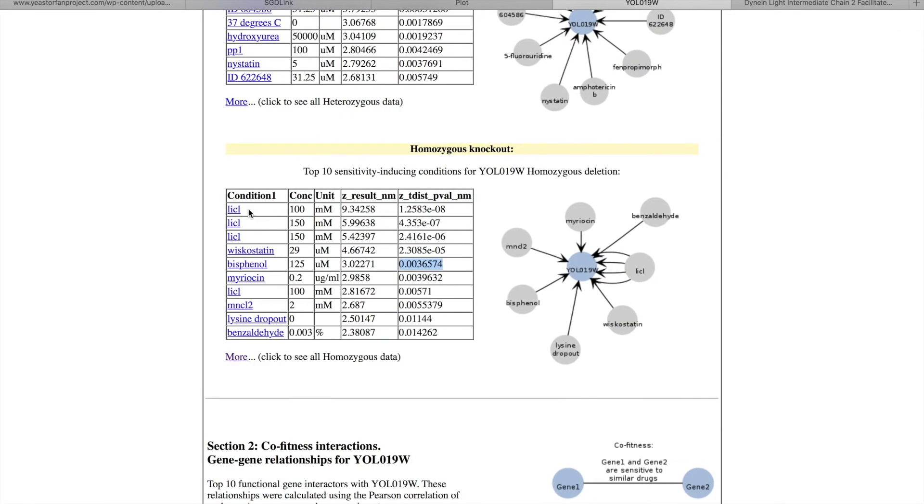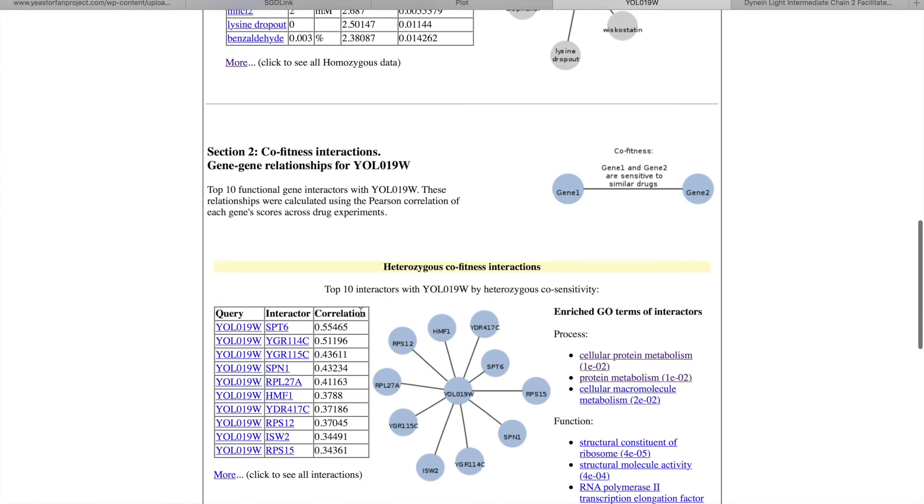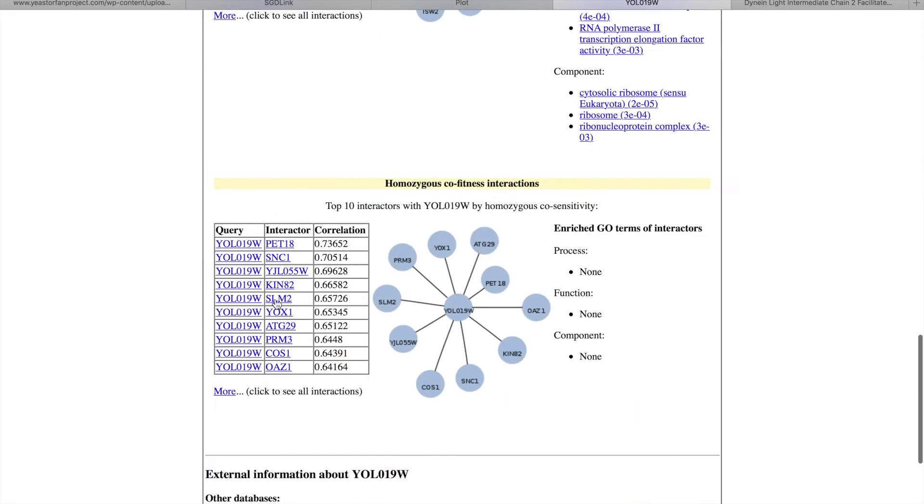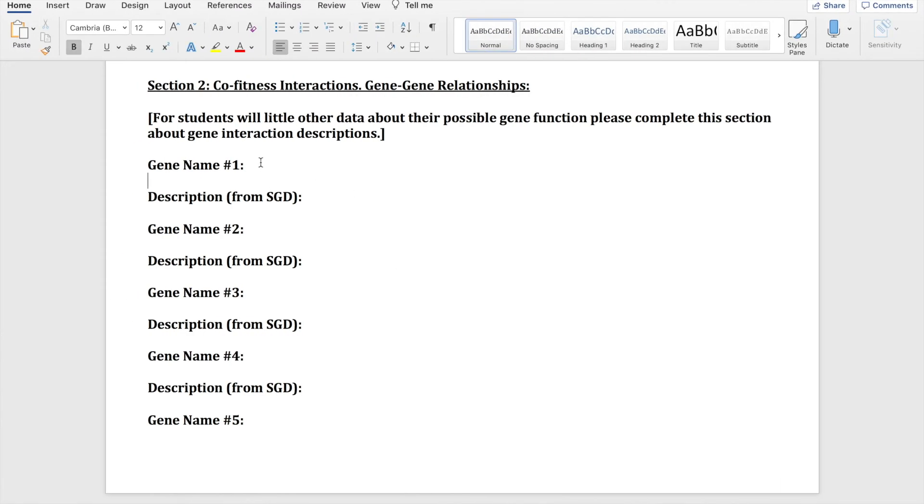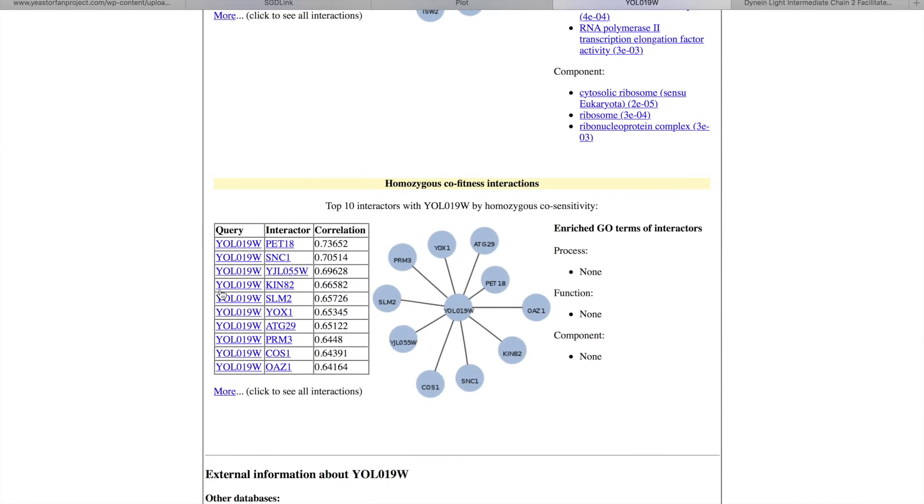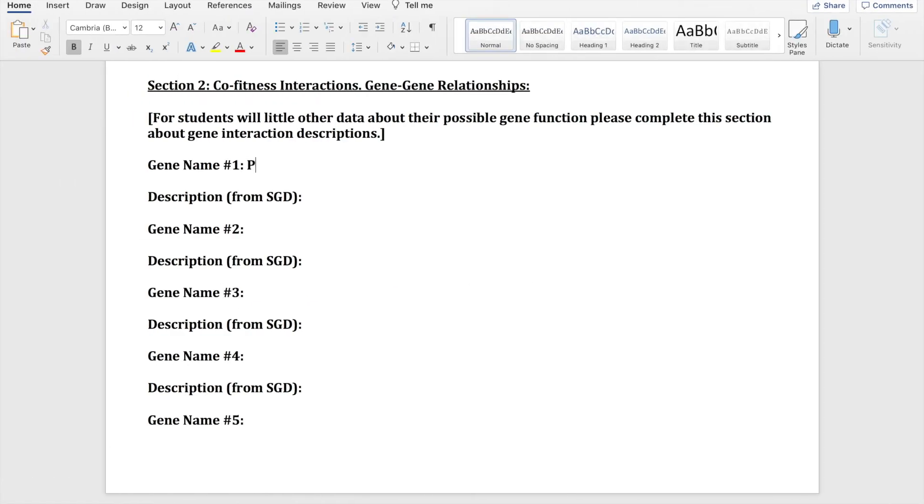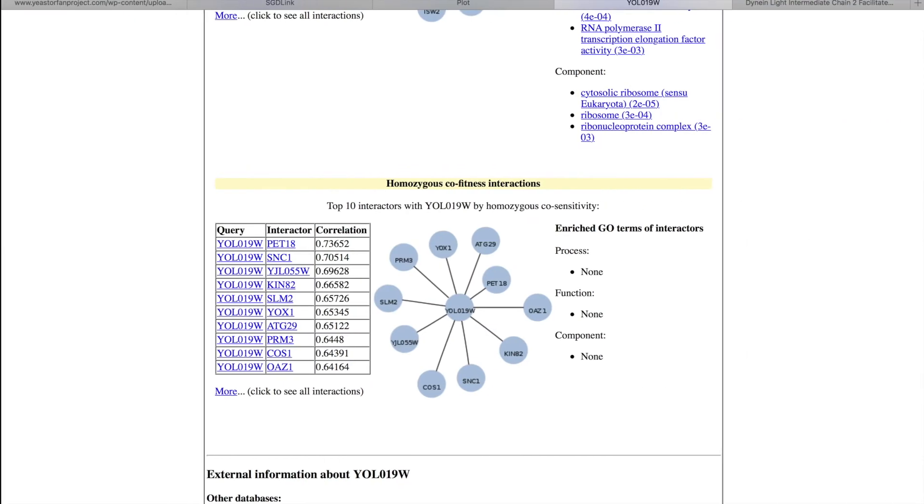Now on to the co-fitness interactions. So again you don't want the heterozygous, you want the homozygous. And it's giving you a gene name. So this one is PET18.